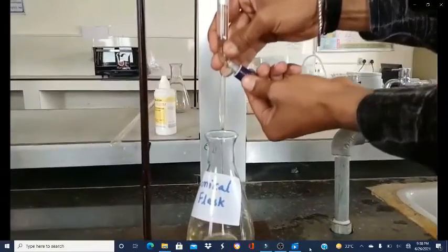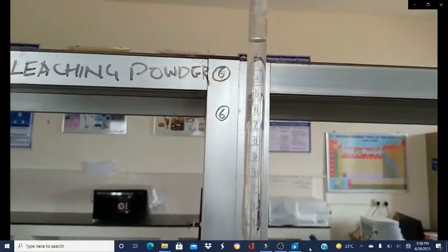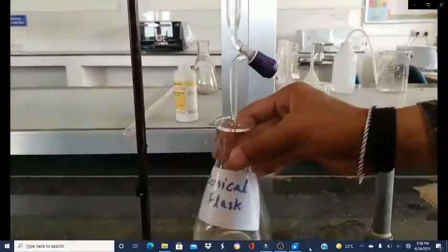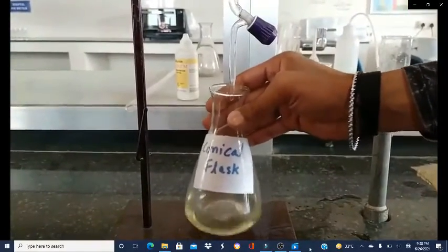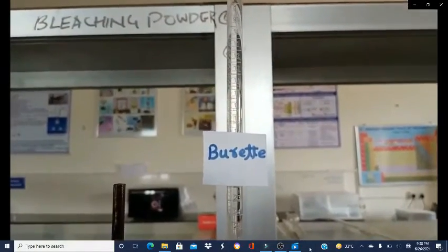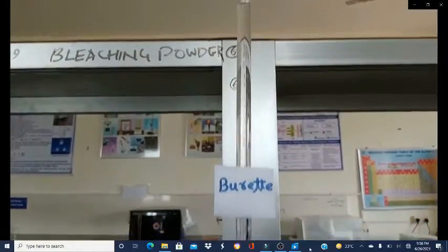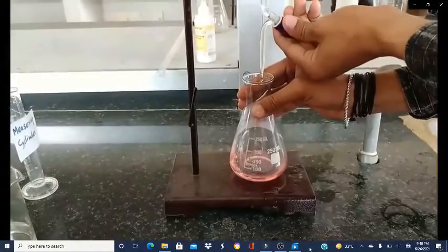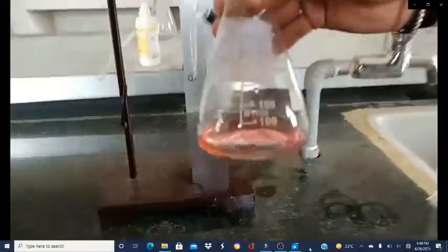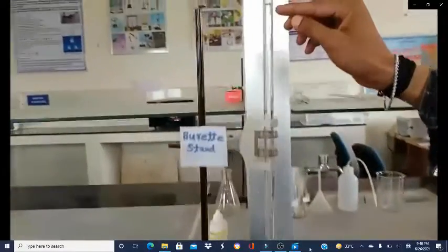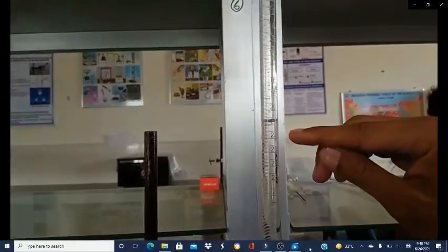Now we will start the titration. While titrating, we need to continuously stir the conical flask to get a homogeneous solution. Here you can see the continuous stirring of the conical flask with the test sample. The color has changed, which suggests the endpoint, and we stop titrating. This is the color in the acidic medium. The endpoint is at 20.8 mL.